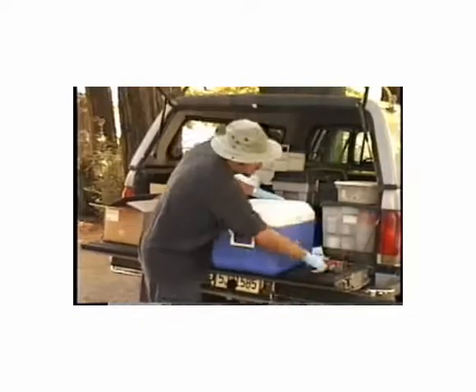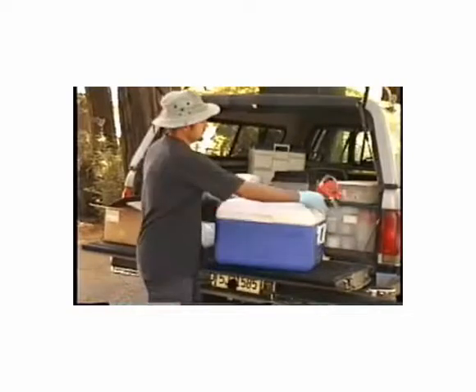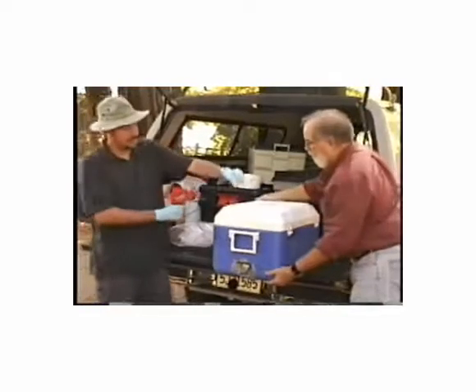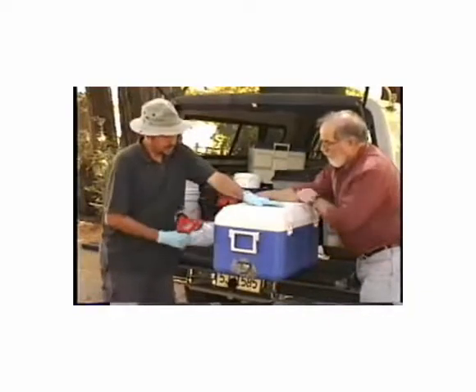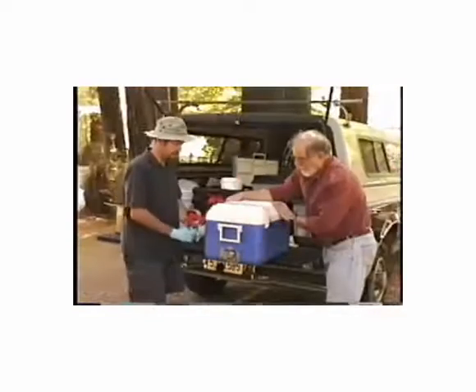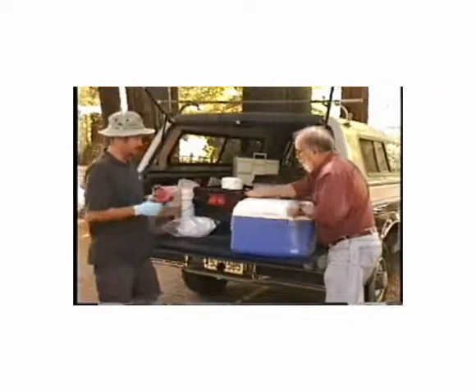We then want to tape the cooler closed on two sides, and we want to wrap the tape, which is clear tape, not duct tape, at least a couple times around the cooler. Again on the other side.